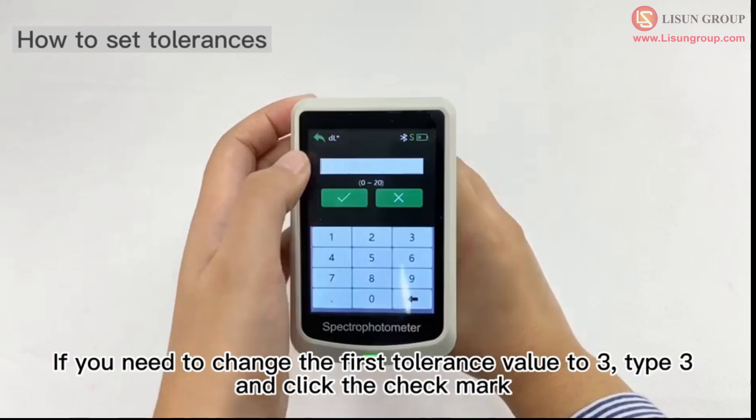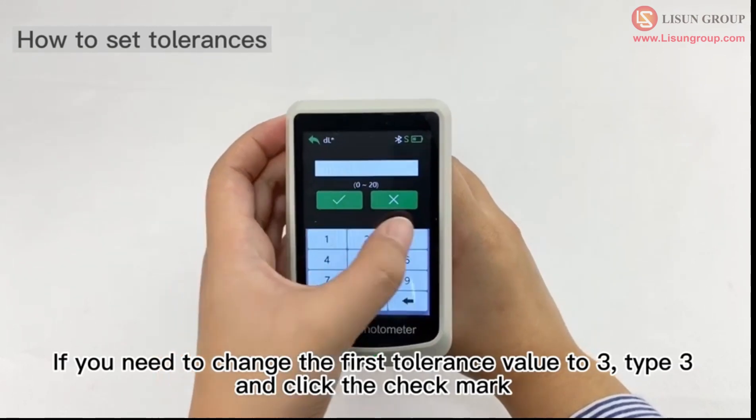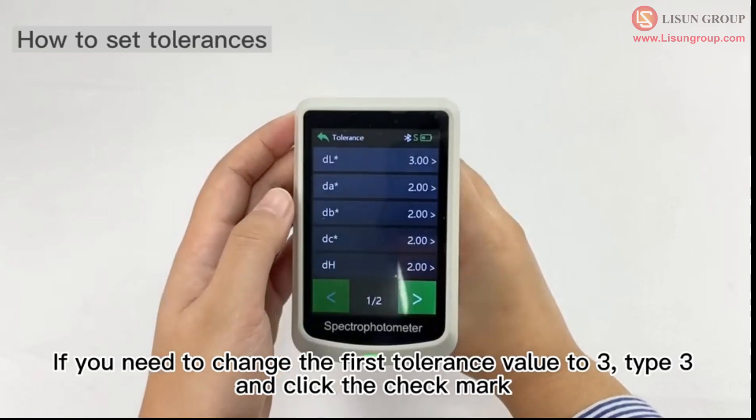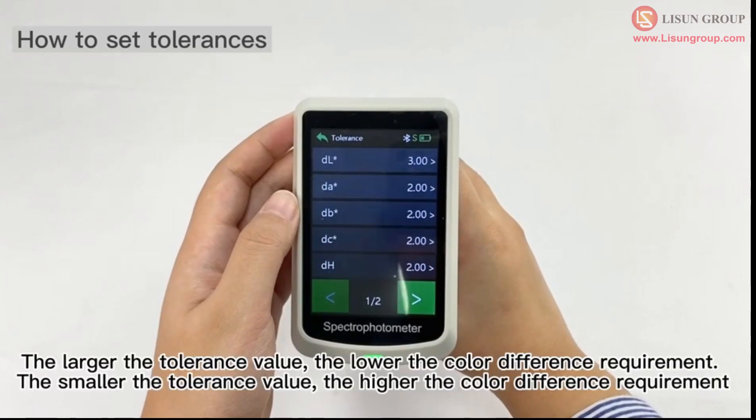If you need to change the first tolerance value to 3, type 3 and click the check mark. The larger the tolerance value, the lower the color difference requirement.